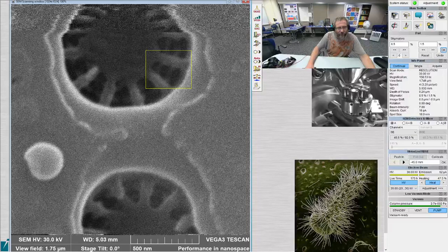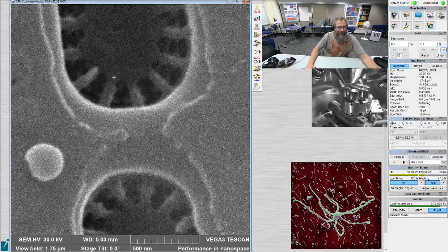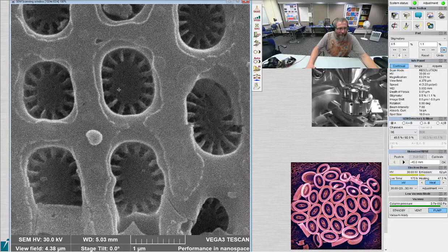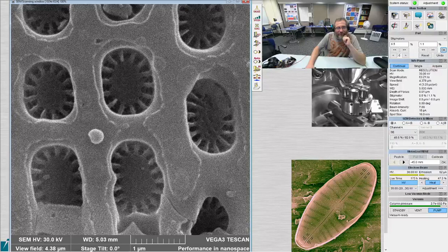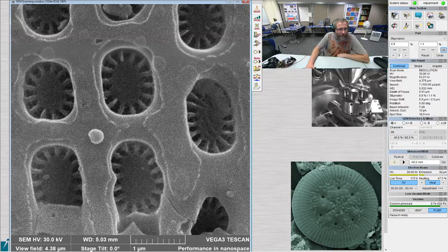Yeah, they do seem like they're getting close. Yeah, that's not bad. Still makes me mad. I could do better, but I need to find something that's slightly better. These are close to being the right shapes and sizes for me to fix the stigmation, but you can see they have crossbars coming around. All of them do. Pretty consistently, yeah.